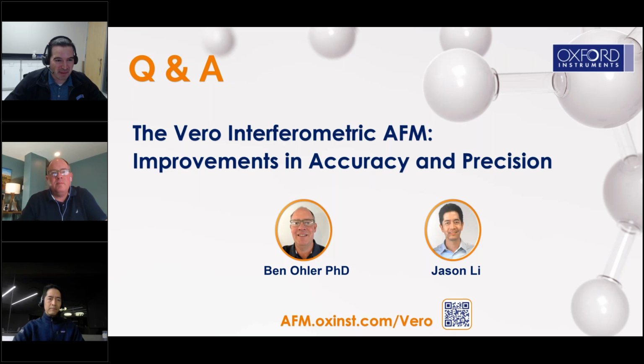Thank you. So another question your way, Ben. Does Vero work in liquid? Yes. As Jason has mentioned, you can use pretty much any probe with Vero, and it is compatible with the same liquid probe holders and liquid cells as the Cypher S and Cypher ES, which can be used on the Vero S and Vero ES. There are a couple of hardware adjustment toggles in the head of the Vero. We select between air or water operation with one of those toggles, and then we select between the silicon nitride probes, which often have the thicker glass probe chips, or the silicon probes, which typically have somewhat thinner probe chips. You set those toggles appropriately, and you can work in air or liquid, with silicon or silicon nitride probes.